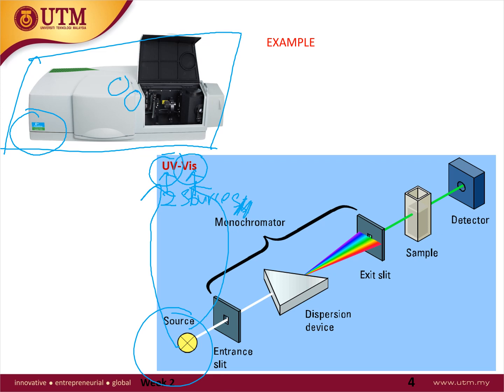The only instrument that can have two, which means research has incorporated a lot of opportunity to put more. You can also find a UV spectrometer only, and combined with visible, you have the second one.